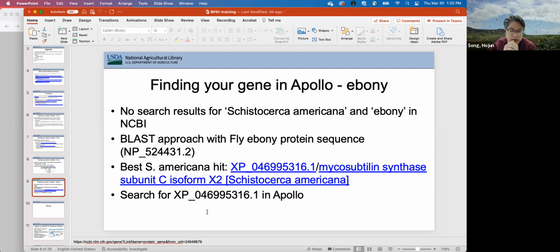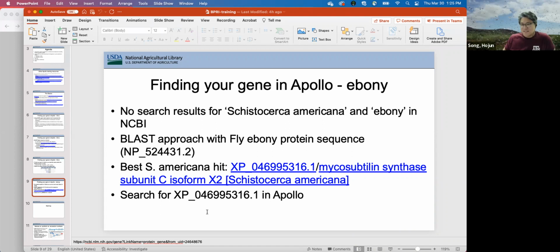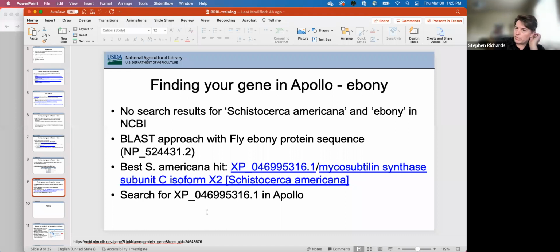Unfortunately, we don't really have anything that's well annotated in Paleoptera. When we go to non-holometabolous insects, I don't know, aphid, some hemipteran might have a decent annotation, but they will compare with Drosophila anyways. Is there a good honeybee? That's probably the most basal holometabolous. Honeybee, yes. OGSv3 is the best annotated so far. I think we're screwed. I think we have to go with Drosophila as the number one choice.